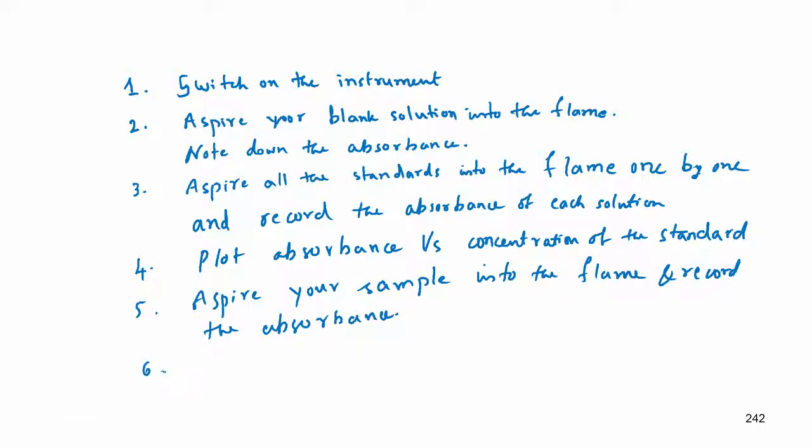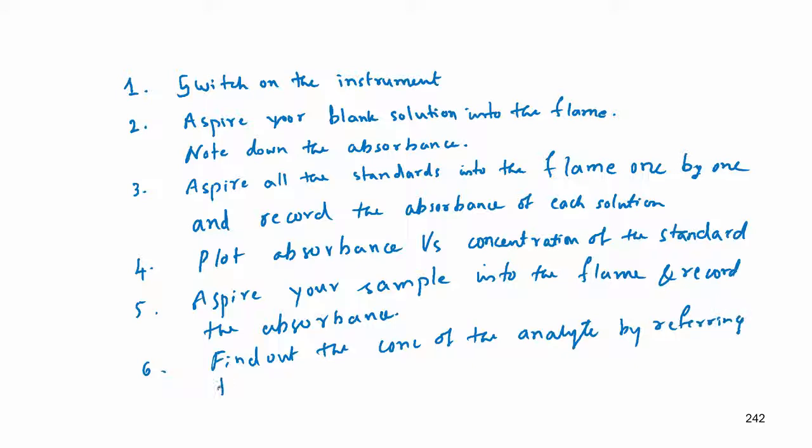The last step would be to find out the concentration of the analyte by referring to the calibration curve.